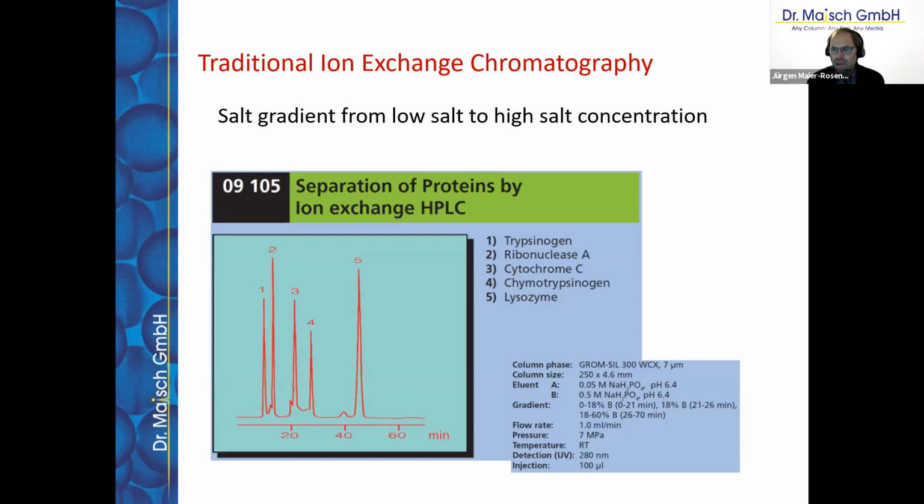So here we have a typical ion exchange chromatogram.